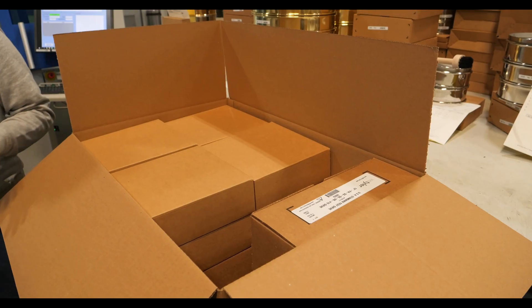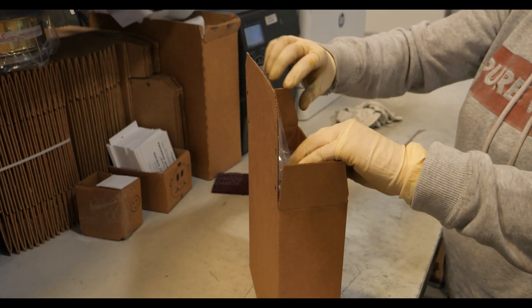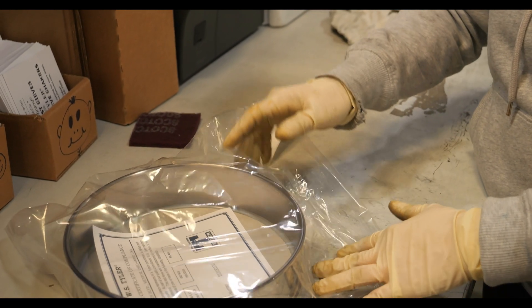As testive analysis requires precise equipment, any damage or imperfections that result from rough shipping conditions are a natural concern. In order to prevent these occurrences, extra steps are taken to ensure that your sieves arrive in pristine condition. Prior to being placed in the main box handed over to the shipper, each testive is placed into its own individual box. Inside these individual boxes is the sieve's certificate of compliance as well as the testive itself. These are all placed into a plastic bag to further protect them from harmful elements such as moisture that may occur during shipment.